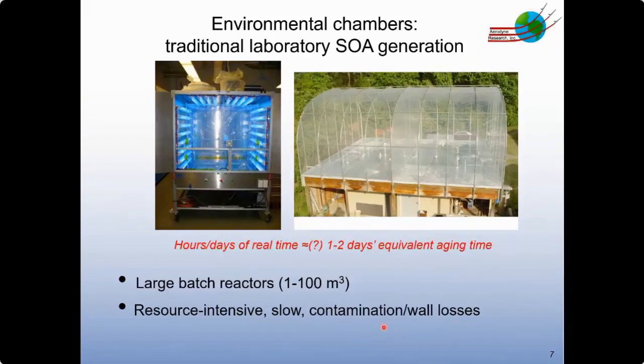They're relatively slow. It takes a day or multiple days to do a single experiment. And as with any large reactor volume, they are sometimes prone to contamination issues and over time, wall losses of particles and gases that can complicate the interpretation of some experiments.